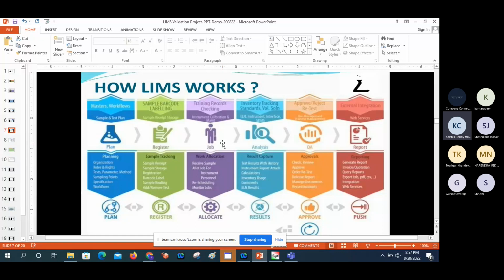All these necessary stocks we need to create in the system under the table manager of the stock table, with approve, reject, and retest. QA has the authorization role. We can assign a specific role to QA, like reviewer or approver. They can reject or approve based on the outcome of the entire lot life cycle, inventory life cycle, or instrument.